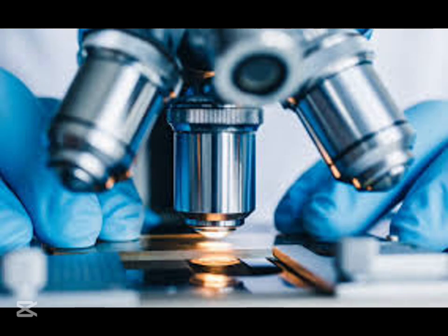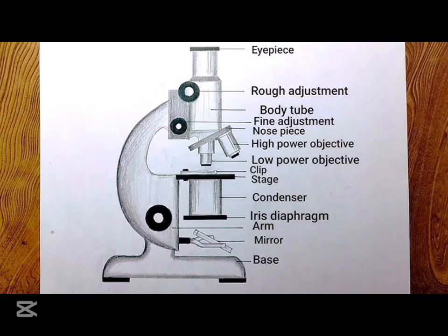Well, remember those dust mites we talked about earlier? Uh-oh. You're not going to make me regret asking, are you? Maybe a little. But they are fascinating to look at under a microscope. You can see all 8 of their legs and their little mouth parts. Okay, that's kind of creepy, but cool. Maybe we can move on to something a little less crawly.